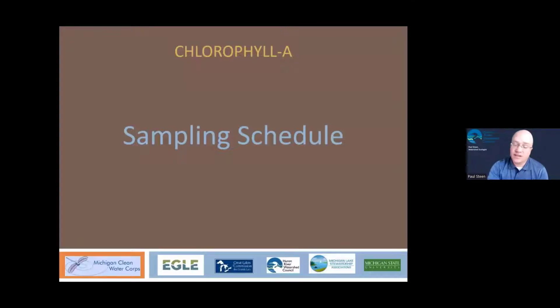A lot of this is nuts and bolts. So Eric really got into the limnology really well, kind of the reasons why we do these things. Chlorophyll is very particular in its process, so I spend quite a bit of time talking about the process itself. So that's actually what we're going to just jump right into.